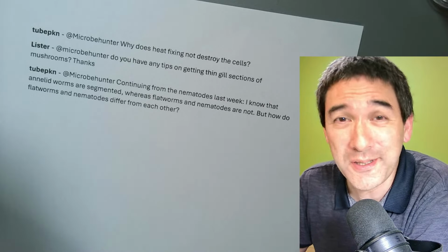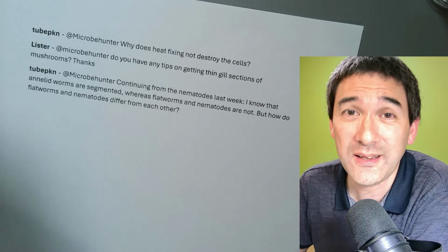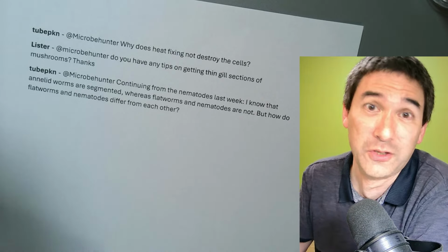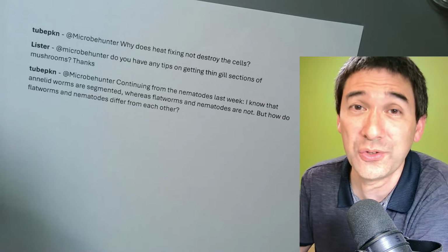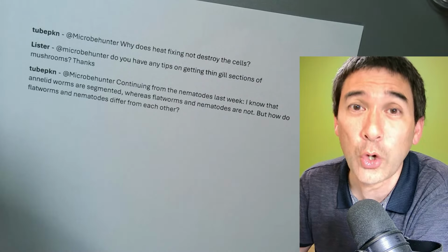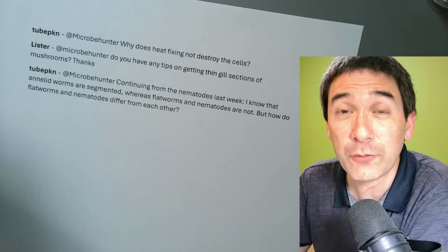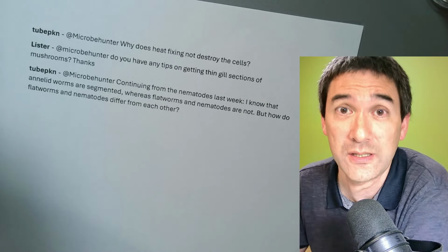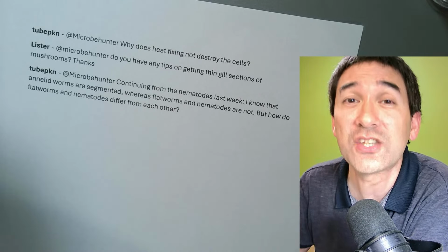If there are contaminants in there, it's a no-go, because if you do chemical analyses, contaminants will certainly give you wrong results. For example, if I want to determine the chemical composition of a bacterial culture to determine which bacteria they are, and I've got contaminants in there, I'm going to get completely messed up results, right? So having pure cultures for standardized experiments is extremely important.